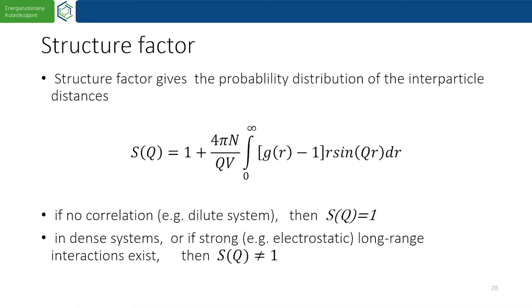Okay, so the measure is the volume of the particle. Then you compare the distance between particles to their volume. This is useful in a practical way, because this is how we usually prepare samples. When we mix the colloidal particles with the solvent, we know how many grams or how much volume to weigh. And we try to prepare samples which are approximately 1% in mass fraction or in volume fraction. I see. So very often the volume and mass fraction are not far from each other. Okay.